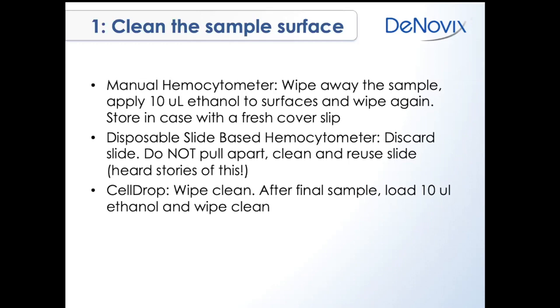With a disposable slide, you want to throw that slide away. Something that we've actually gotten questions about, believe it or not, is people want to pull apart the glued plastic on these disposable slides and then try to clean and reuse the slides. Please do not do that. That's not good technique, and you're not going to get an accurate count from that slide the second time.